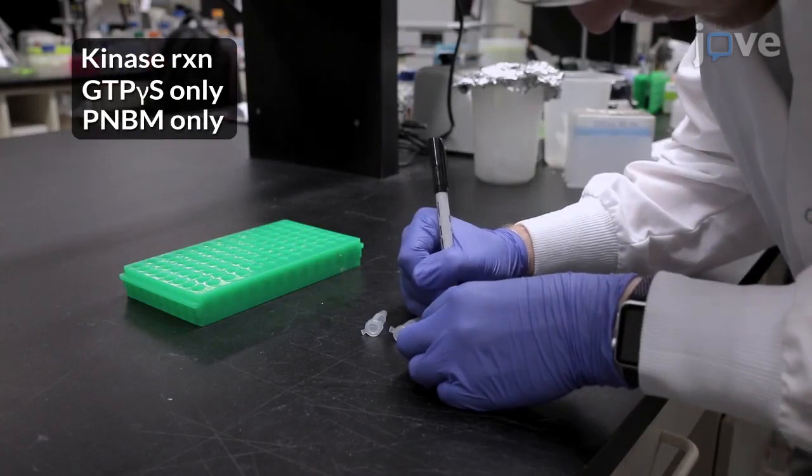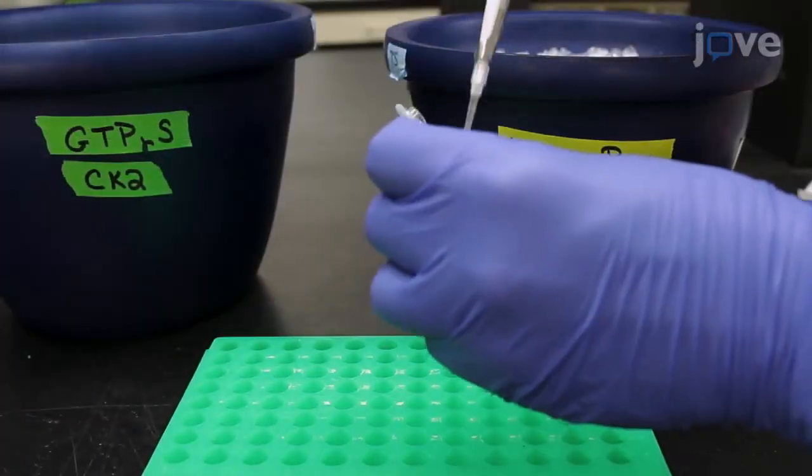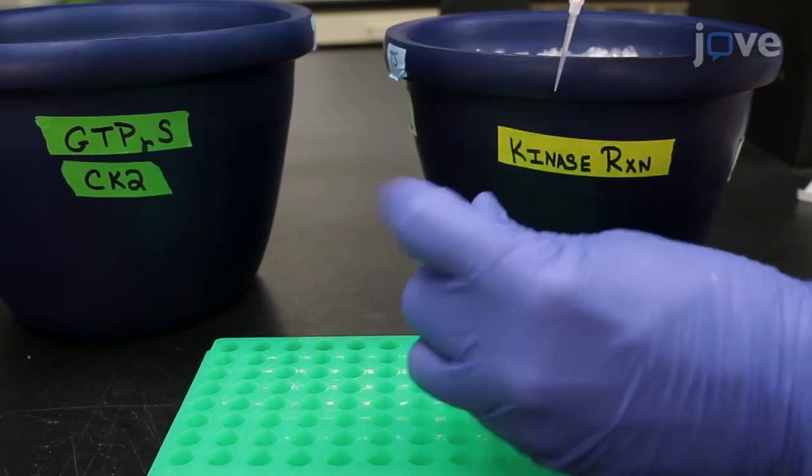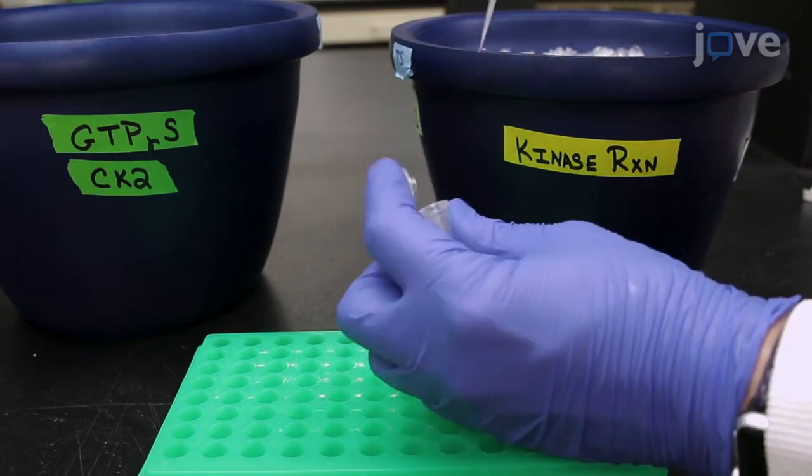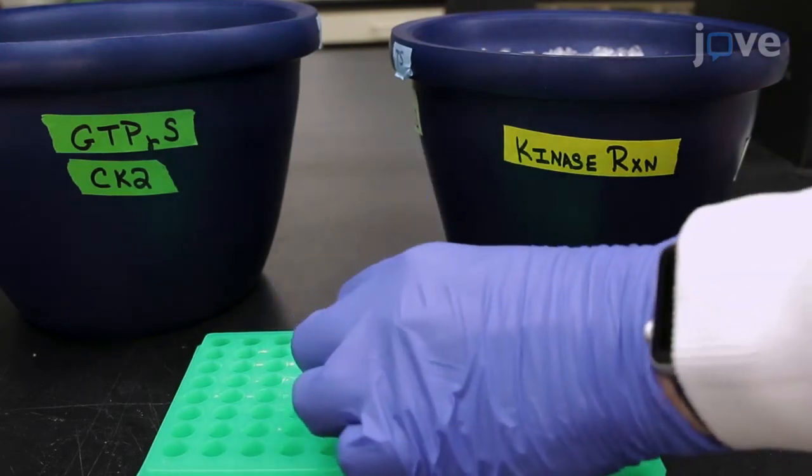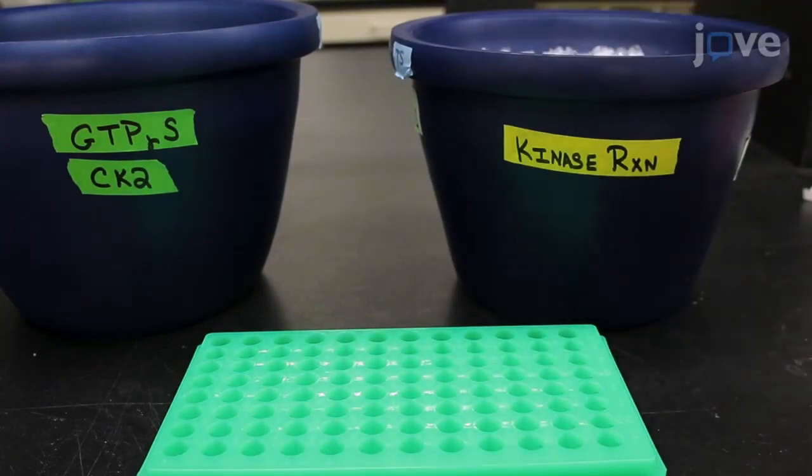First, label each of the three sample tubes as shown here. To the kinase reaction tube, add 2.7 microliters of 2.5 millimolar GTP-γ-S. Flick the tube to mix and immediately place it on ice.